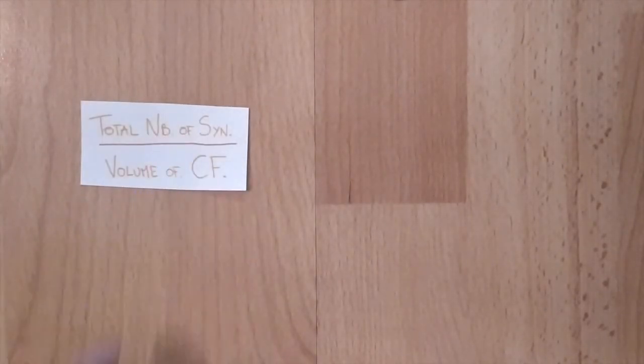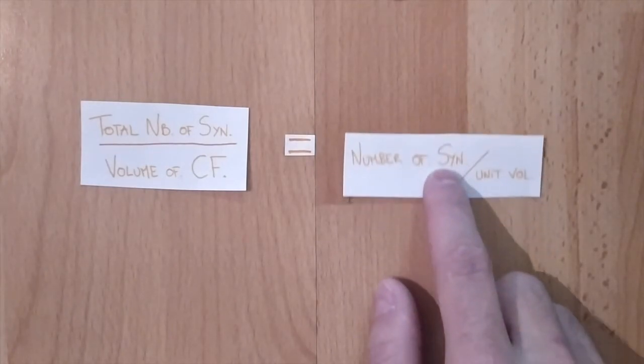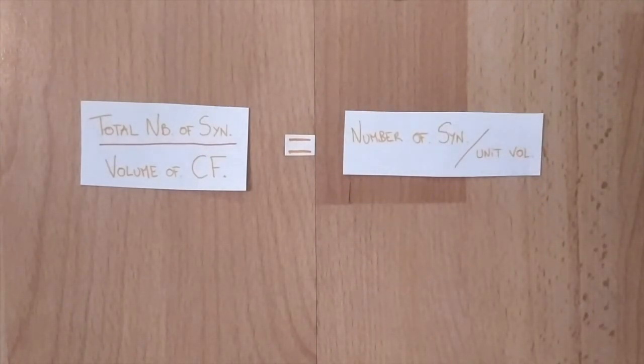Then, they divided the total number of synapses counted on each section by the volume of the counting frame to obtain the number of synapses per unit volume. This is how they obtain an average number of synapses per studied regions.